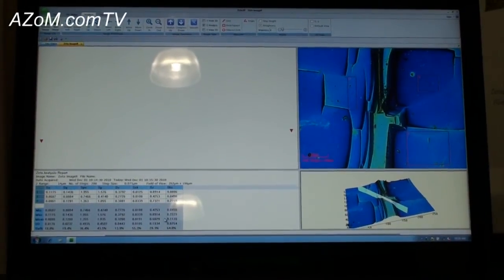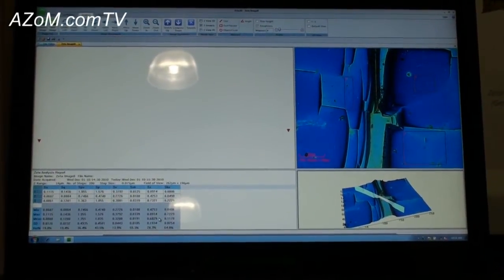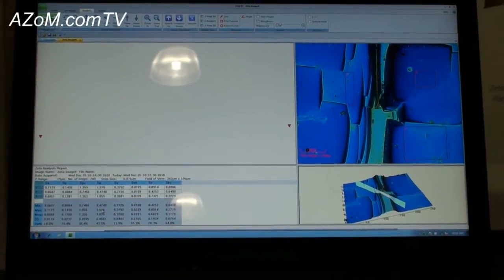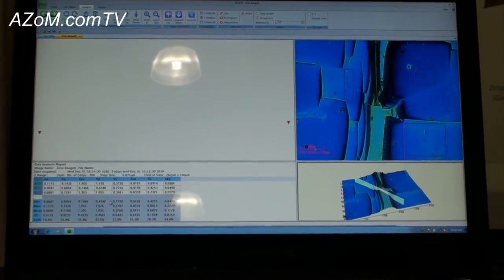I would actually have average values for everything contained within a box. The system lets you very easily collect the data, save the data, export the data out. So it's efficient in terms of its ease of use and operation.